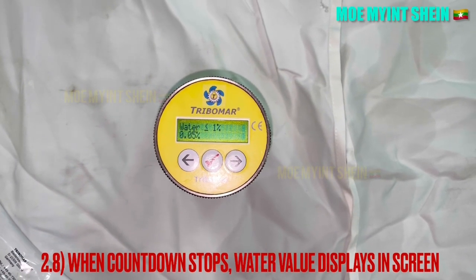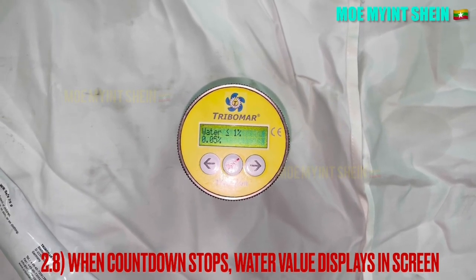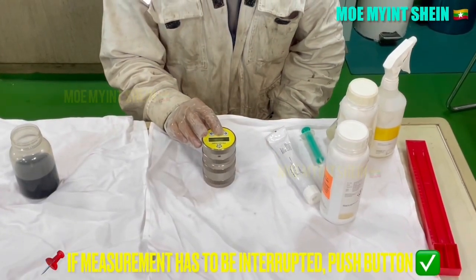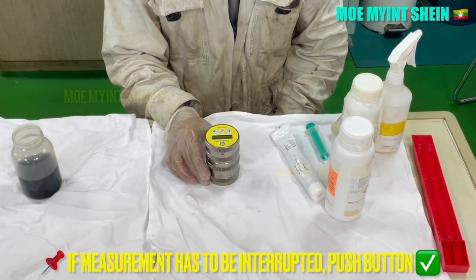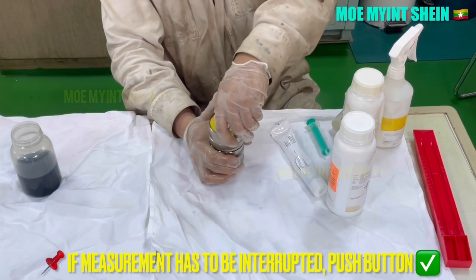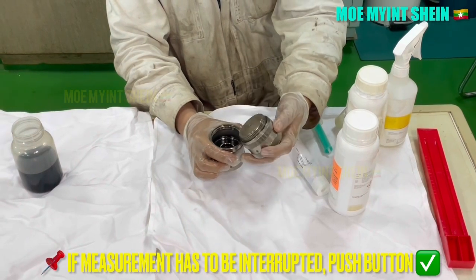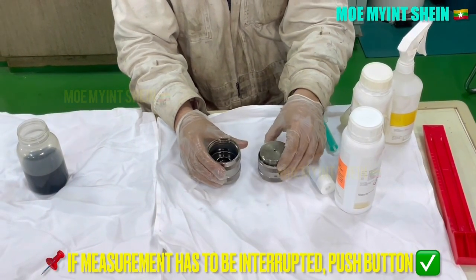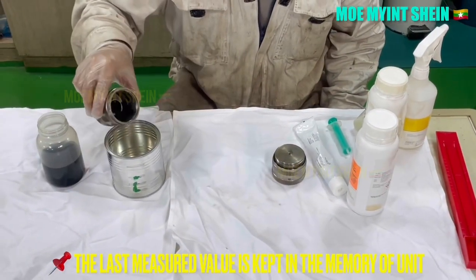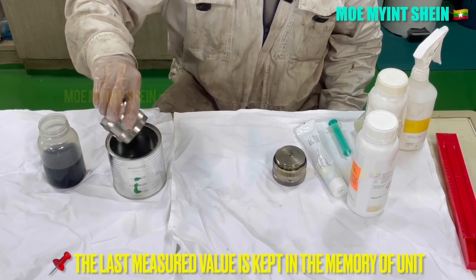Water content percentage will display on the screen when the countdown stops. If you wish to interrupt the test, you can press the right marked button to terminate the test. The last measurement result is also kept in memory of the unit.